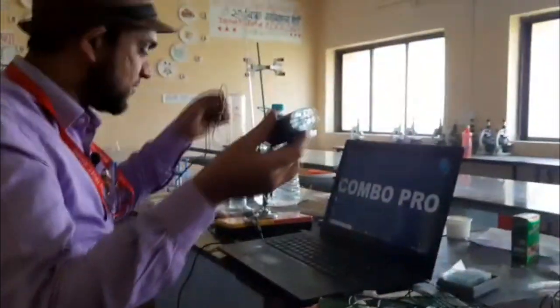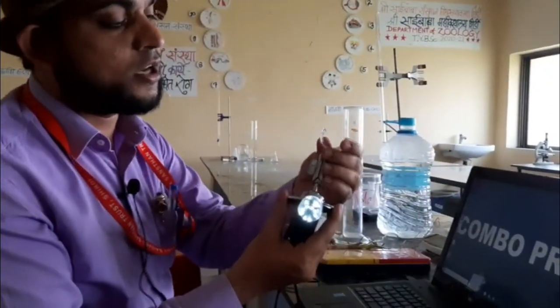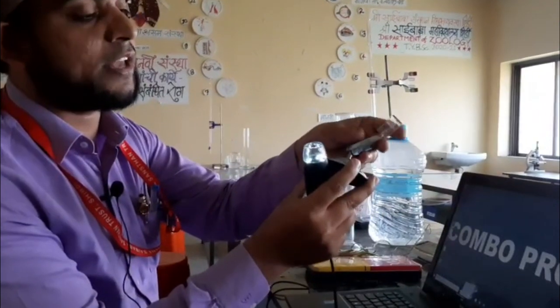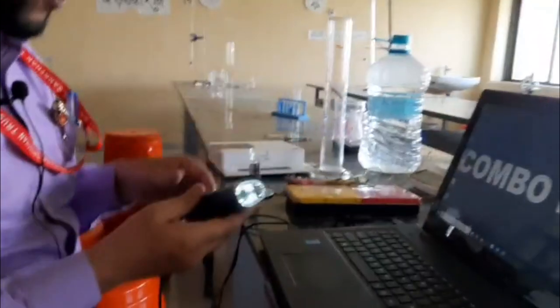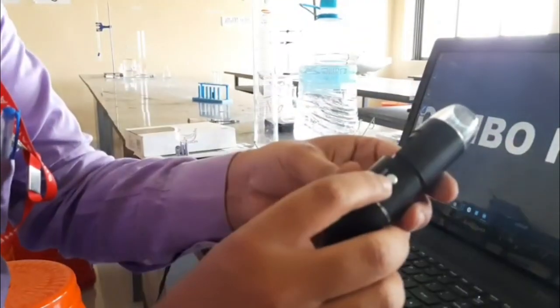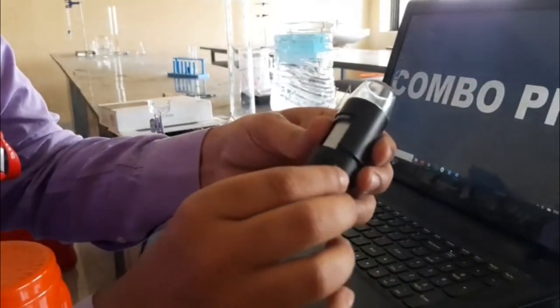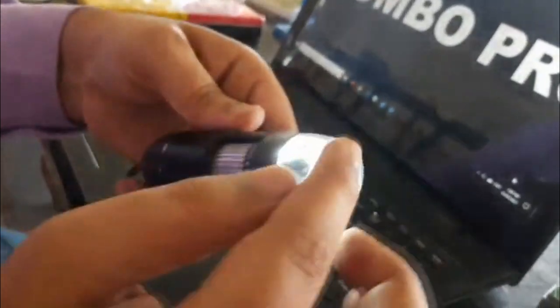We've already inserted the USB cable. The stand is included but not needed right now. I'll show later how it rotates 360 degrees — you can bend it upward or rotate it anywhere. To take photographs, there is a snap button. To zoom in on the object, there is a zoom knob. These two buttons — zoom and snap — allow magnification from 50x to 1000x, with 80 LED lights.